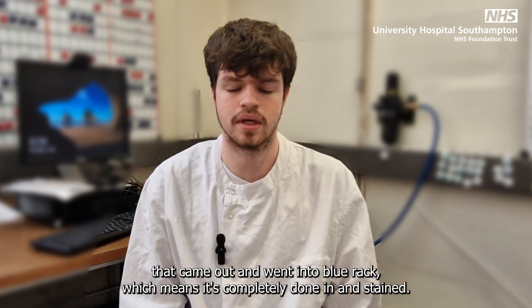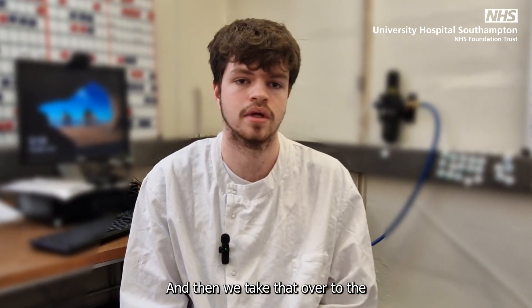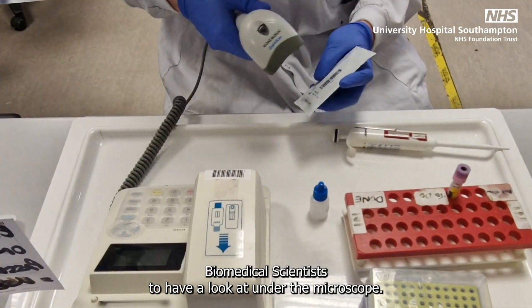However, this one came out and went into the blue rack, which means it's completely done and stained, and then we take that over to the biomedical scientists to have a look at under the microscope.